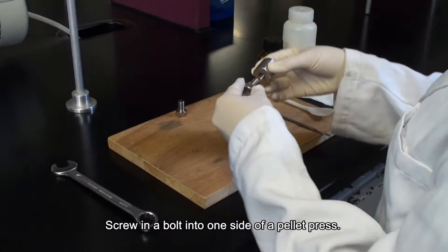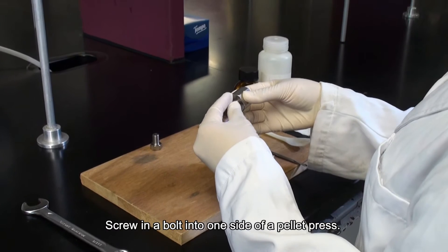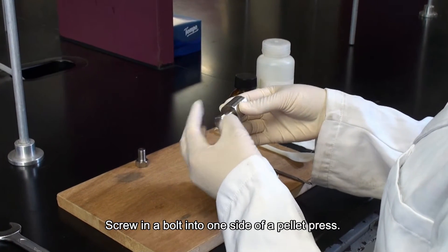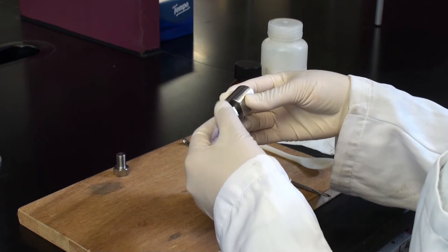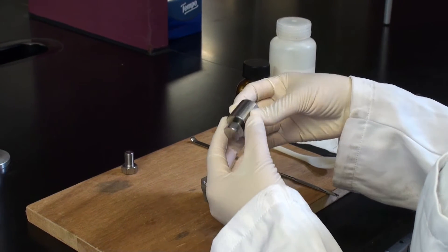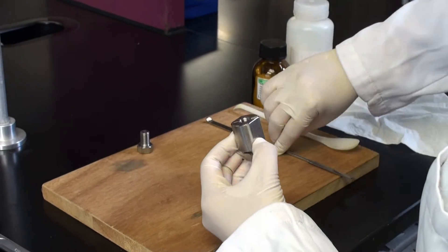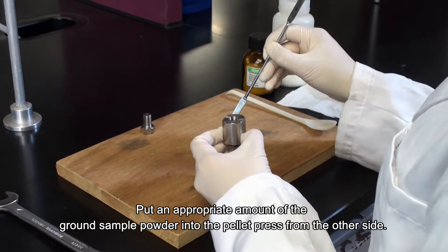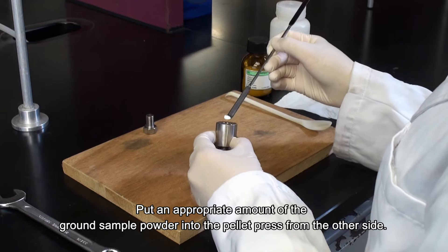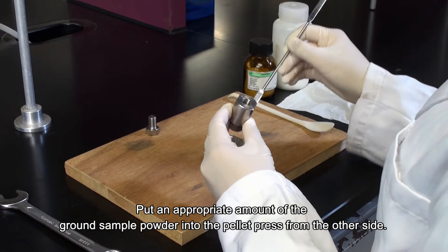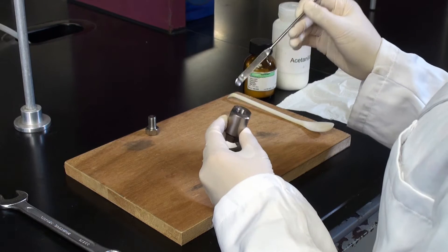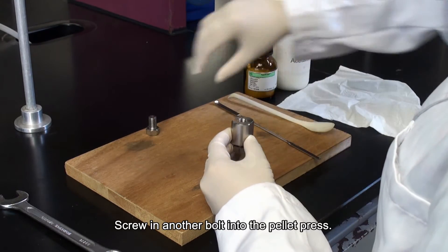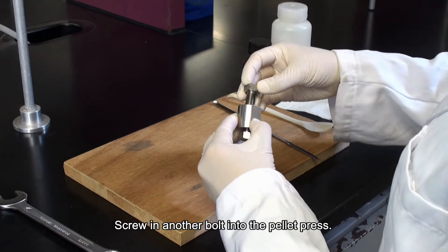Screw in a bolt into one side of a pellet press. Put an appropriate amount of the ground sample powder into the pellet press from the other side. Screw in another bolt into the pellet press.